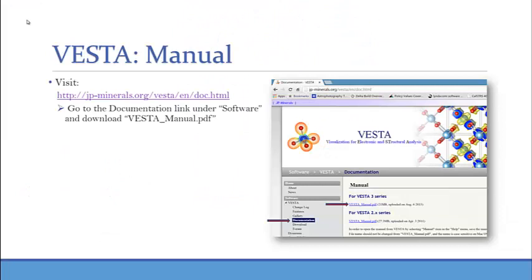So as you can see, this is a great tool to visualize models and how atoms are packed. For more information and to find out all the other features that are available with VESTA, visit the VESTA webpage. And if you go under the software tab, under documentation, you will see that the VESTA manual is available for you to download.